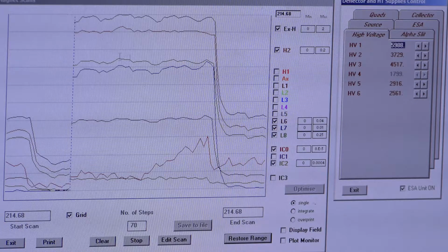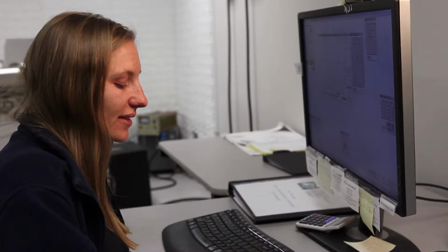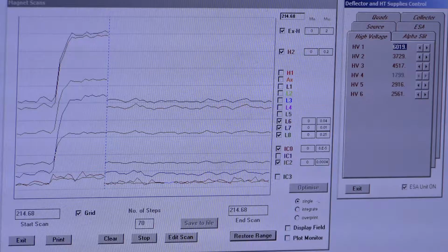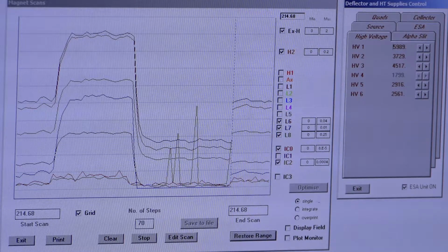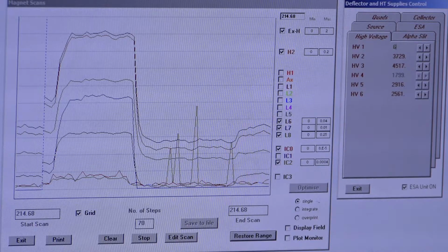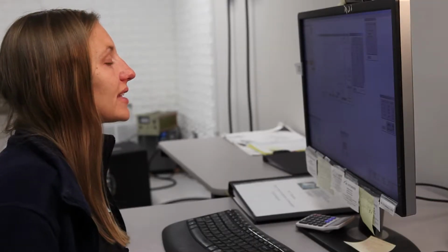Got quite a big jump there, so let's change that. Let's try 19. So it looked like 6019 was a pretty good midpoint, but let's confirm that. 6049. And then 5989. And that's a pretty small dip. So let's go with that. Generally, HV1 on your first pass always changes by the second. That's pretty normal.